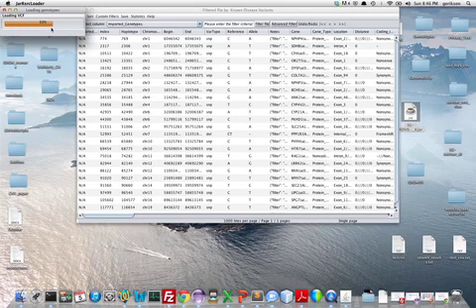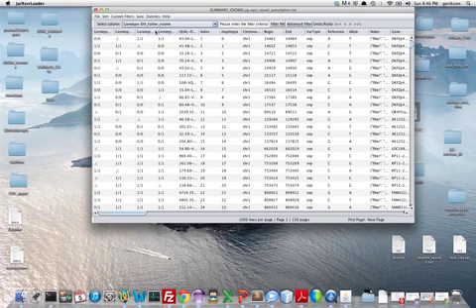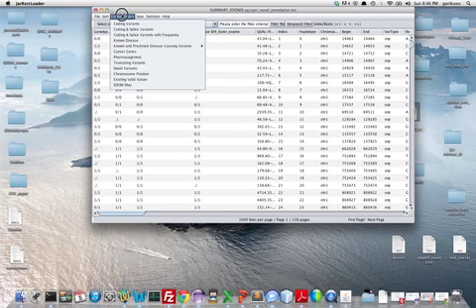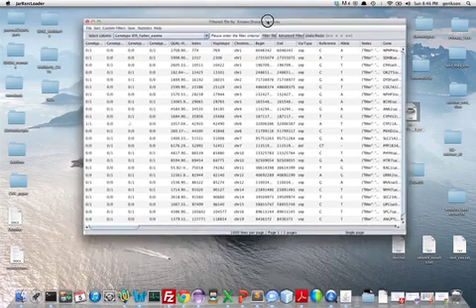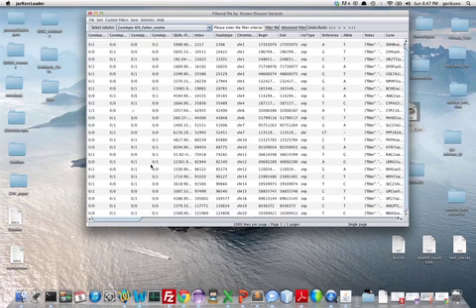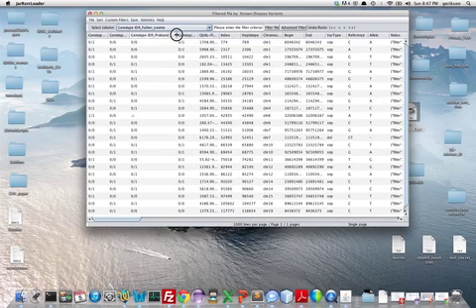So the genotypes are loaded up front. This is the proband. You will have to do the known disease filter again. And so these are all of the category 1 variants. However, when you look up front, none of the variants are homozygous or de novo in the proband.